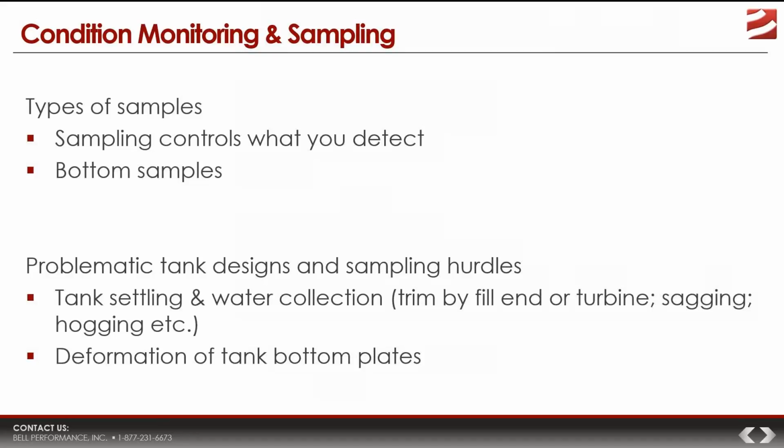Now, microbes. When we talk about condition monitoring, really the bottom line is that we want to use condition monitoring to make sure we don't have a microbial problem. And that's because we know microbial presence is linked to a whole bunch of bad stuff.